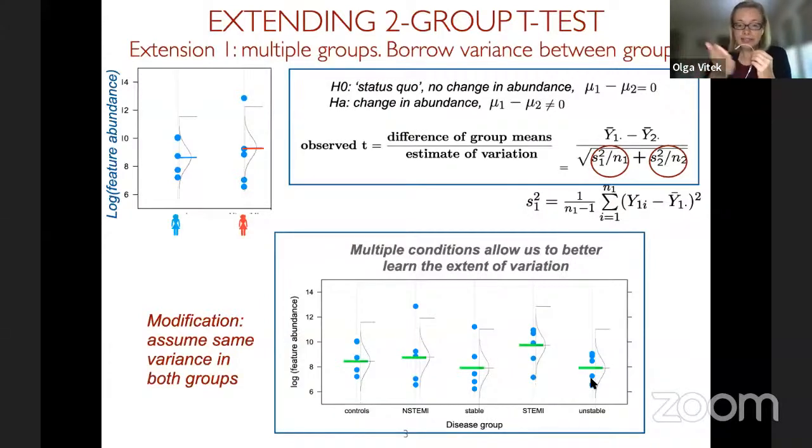If they are not, such as in experiments with TMT, as we will discuss, then we need to do something else. So yes, we can fit ANOVA models, but only for the experimental designs when this is actually appropriate. And the good news is that MSstats does a lot of parsing in the backend to figure out which model is actually appropriate for each experimental design. But this is the use of the analysis of variance potential.